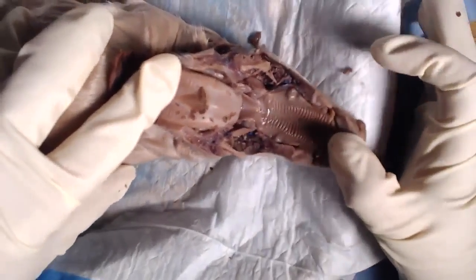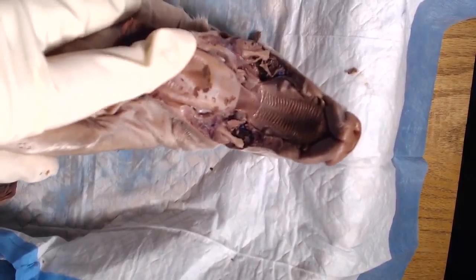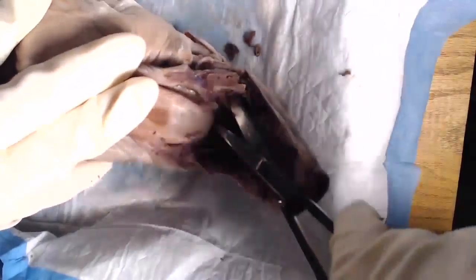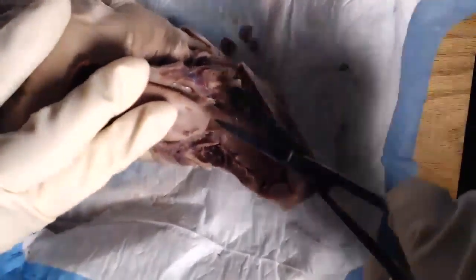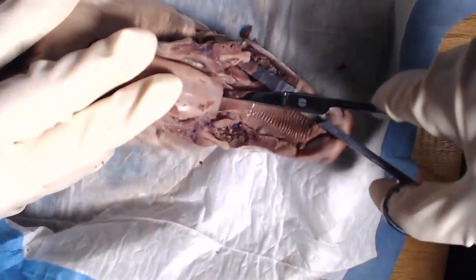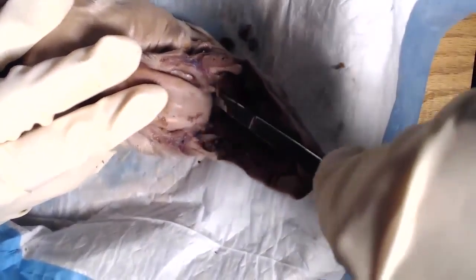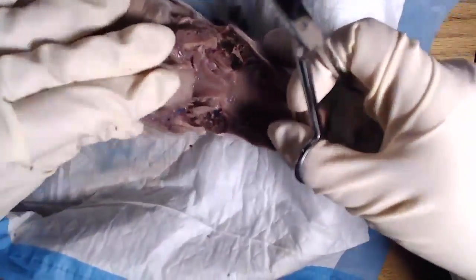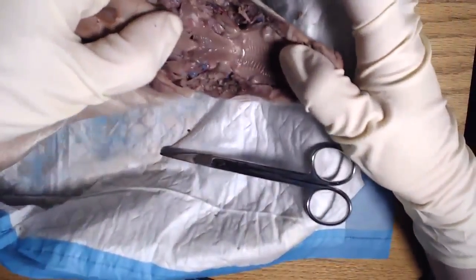All right, and then we're just going to take our scissors, and once we're at this point, we're going to extend those cuts a little bit more on either side, but we want to aim for the very back of the tongue, where we can kind of see the esophagus. So just take your scissors all the way in the back like this on one side and cut straight down into the esophagus. We just want to pull out our tongue a little bit more. There we go.